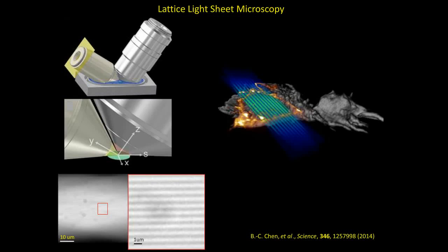So here I will show you how we construct the imaging core of the lattice light sheet microscope. We send the light from the left, where there is an excitation objective, and the detection one is a huge one, from Nikon with 1.1 numerical aperture. Both are dipping lenses, and we are doing live imaging. So we dip these two objectives directly inside the imaging medium. These two are very, very tight.